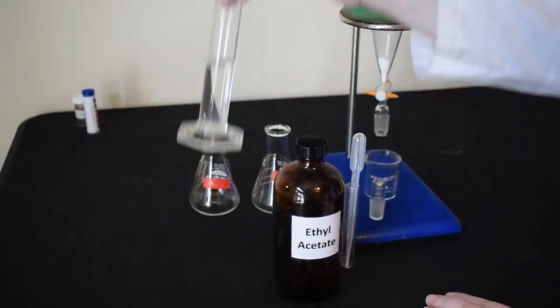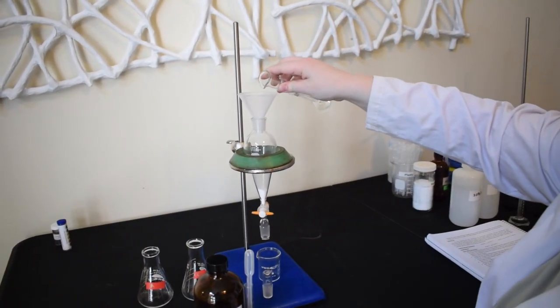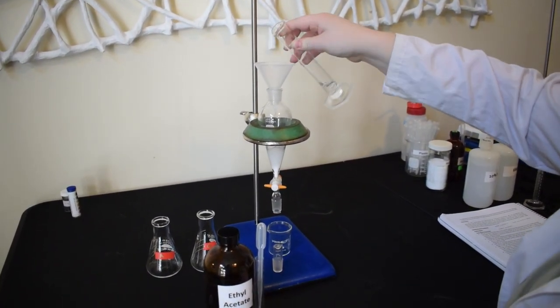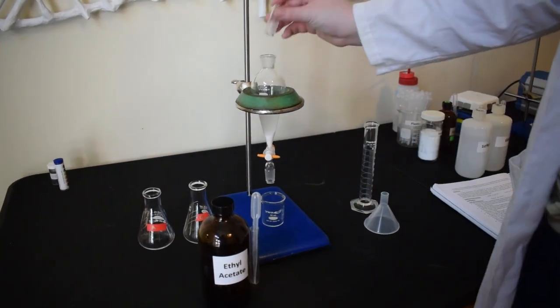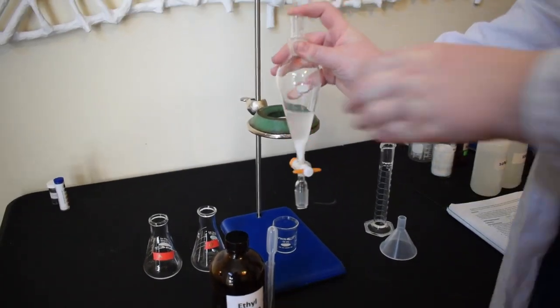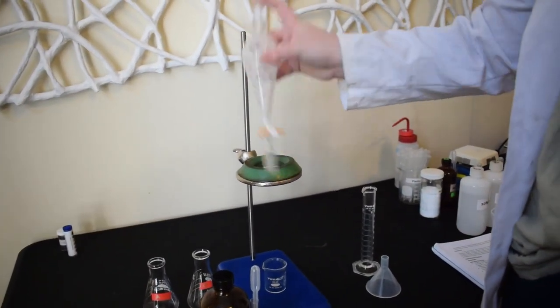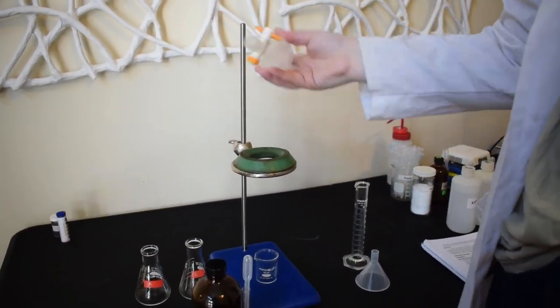We are going to dissolve this Goody's powder in 25 milliliters of ethyl acetate. Once that's added, we are just going to shake until it is mostly dissolved. It won't dissolve 100% in ethyl acetate, but it should get most of the way there.